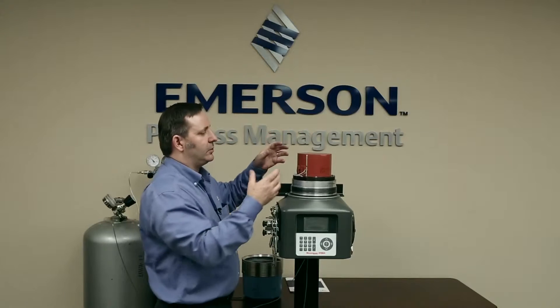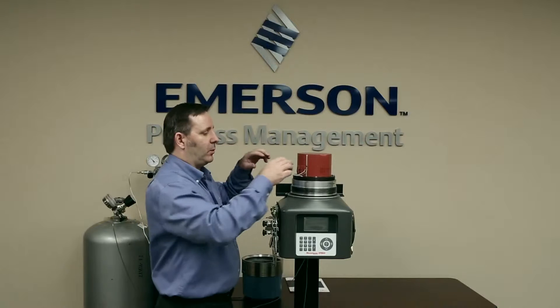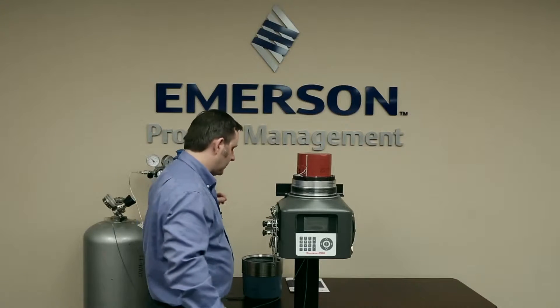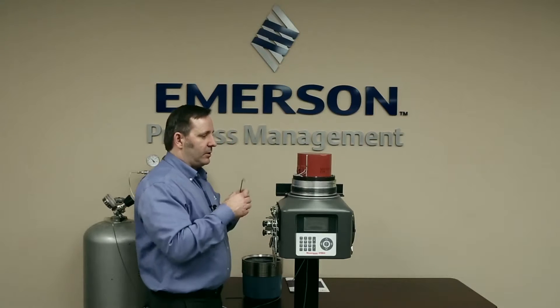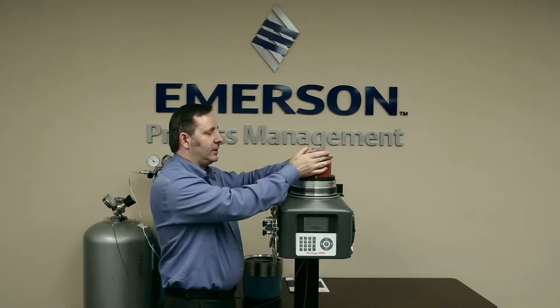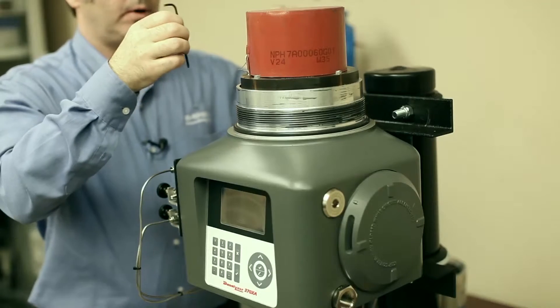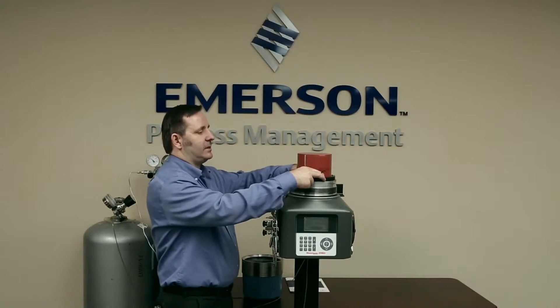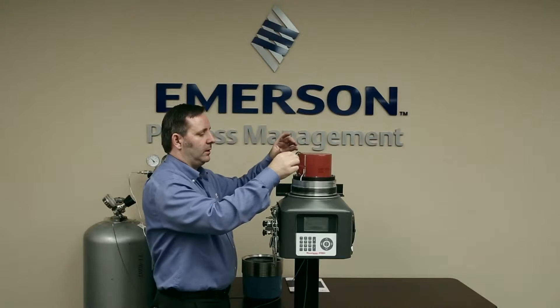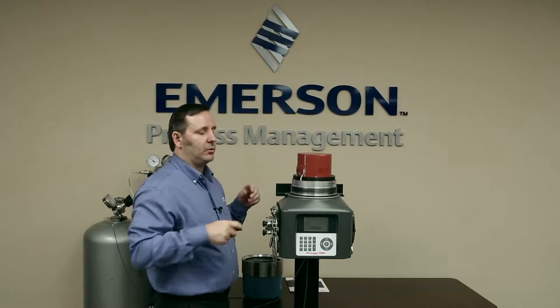It doesn't really matter. What we need to do is take that insulated cap off so that we can get to the four screws that hold down the module. Here is the analytical module — there's no need for us to get inside the oven or inside the actual analytical components. So what we're going to do is take this analytical module off, disconnect the three connectors, and then put on the new module.